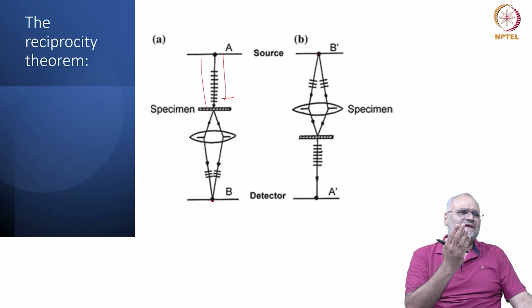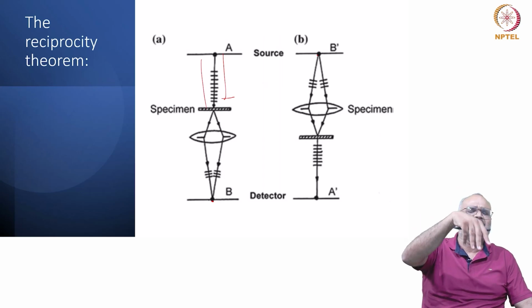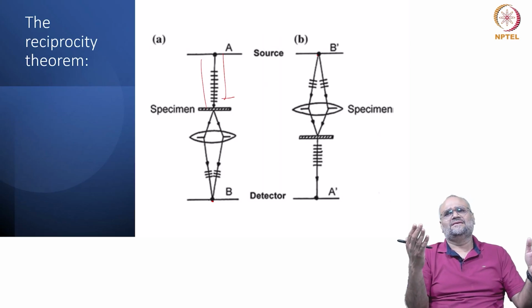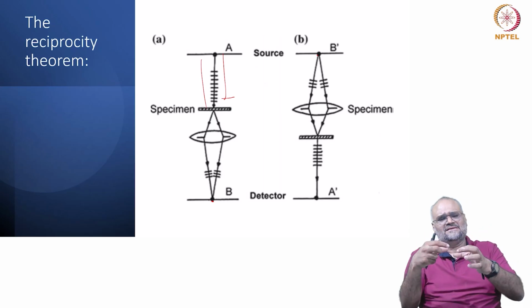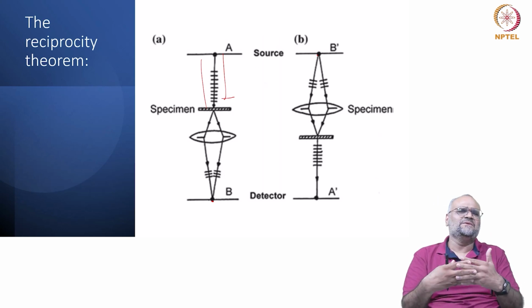The phase contrast that we saw in TEM mode in HR-TEM images, where the interference between the 2 or the 3 and the multiple spots that were formed at the back focal plane to form an interference pattern, is exactly the same kind of a mechanism in STEM mode, where if I assume there are small disks, overlapping disks, these would be kind of interfering with each other to produce the contrast even in HR-STEM images.